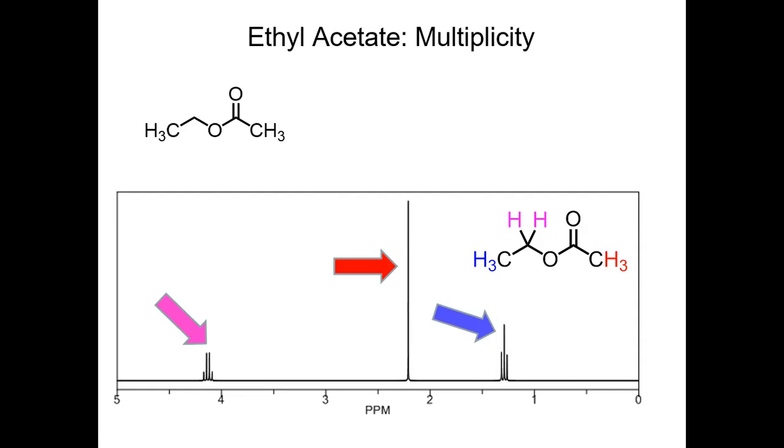2, right? Good. These protons see these 2 protons up here on this adjacent carbon as neighbors. So N for this set of protons is 2, so N+1 is going to be 3. So that's going to be split into a triplet, right? That's what you see right here, 3 lines. That's called a triplet. So you have a triplet, a singlet, and a quartet, right?